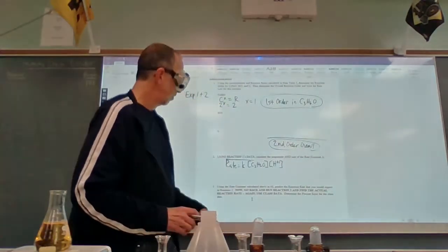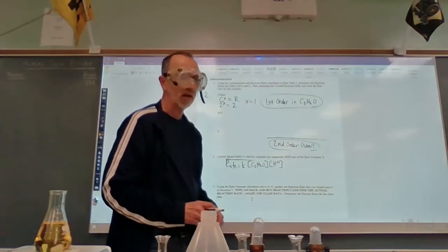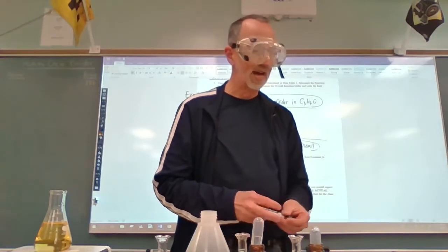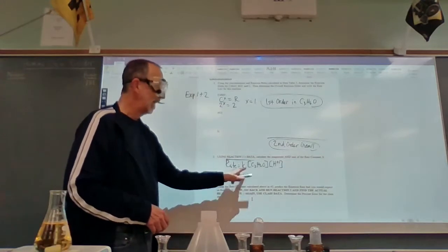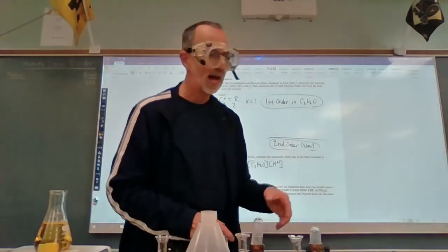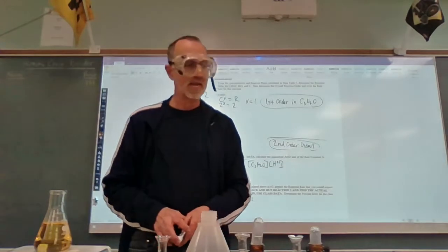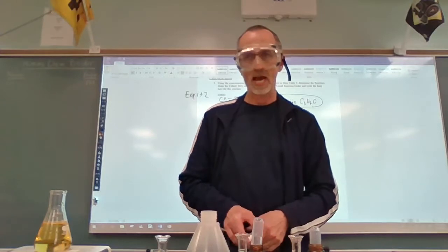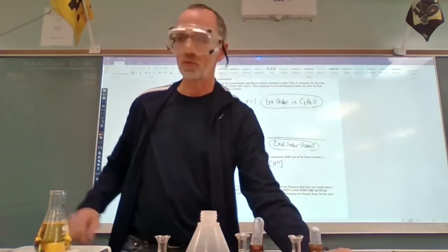And then down here at number 3, using the rate constant calculated above, so now you'll have a K, all right? Predict the reaction rate that you would expect in reaction 5. So you're going to set up the rate law again. Now we have K. You're going to plug in the values of these 2 concentrations from reaction 5, and then you are going to calculate the rate. And that would be your theoretical rate. Let's go back and do reaction 5 and get our actual rate.